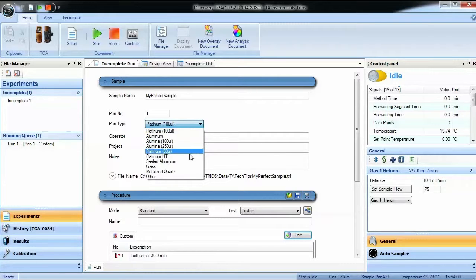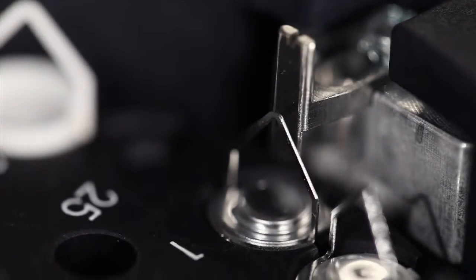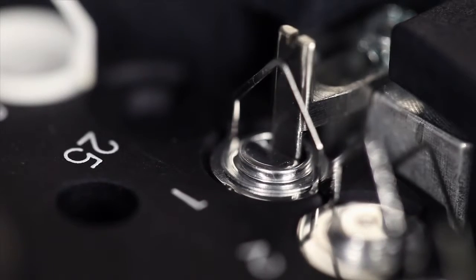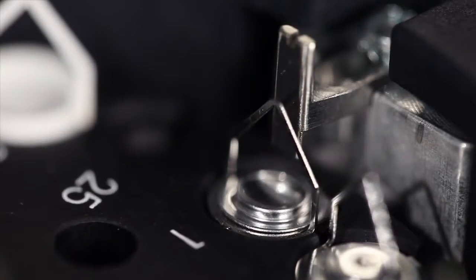Selecting the correct pen type in the software is important for running a successful TGA experiment. For example, depending on the pen type, the software will limit the upper temperature or activate the punching mechanism.